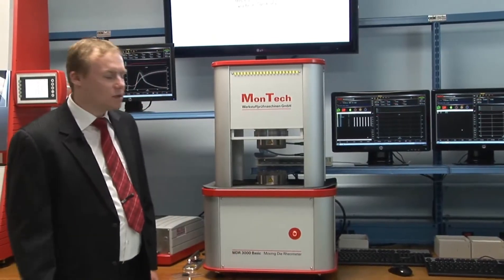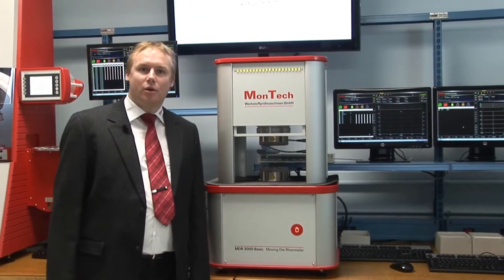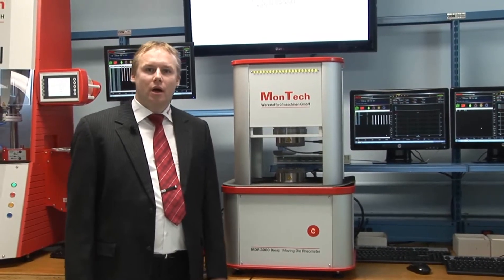Hello, my name is Ralf from MONTECH and today I would like to introduce the MDR3000 BASIC to you. The MDR3000 is a moving die rheometer according to international standards like ISO, ASTM, DIN and JIS. The instrument is used for measurement of curing of rubber materials.